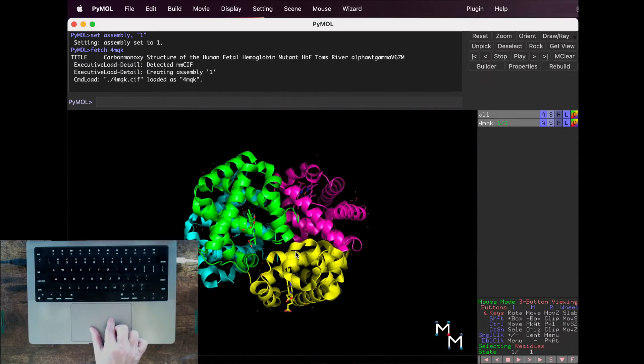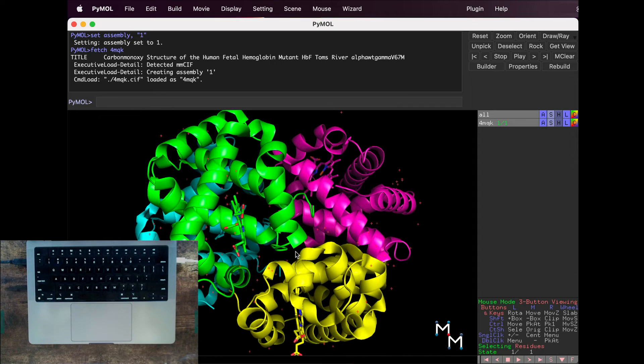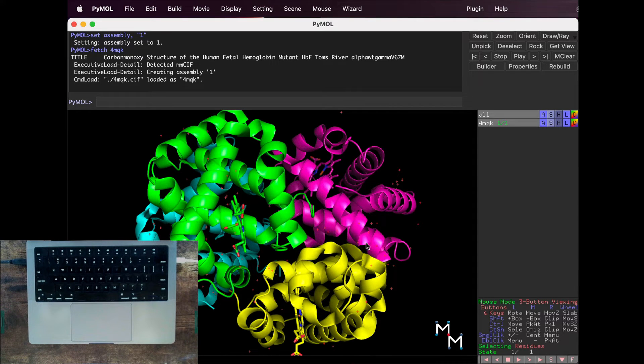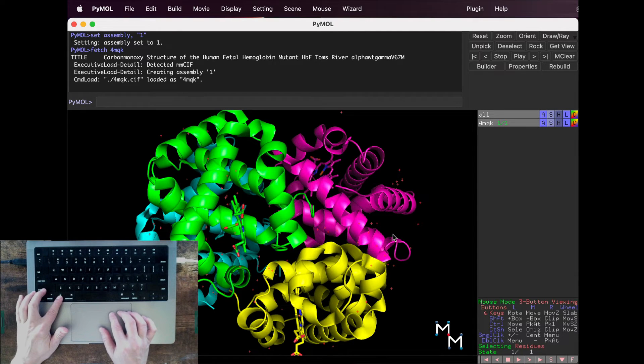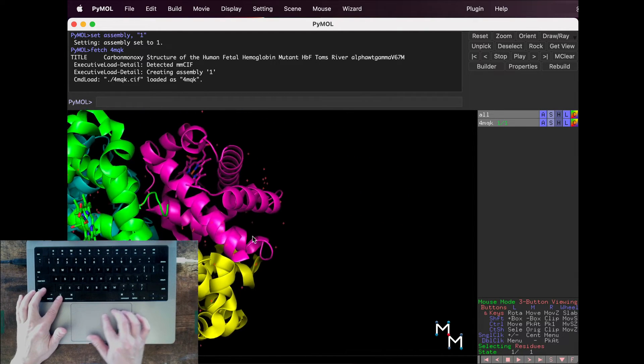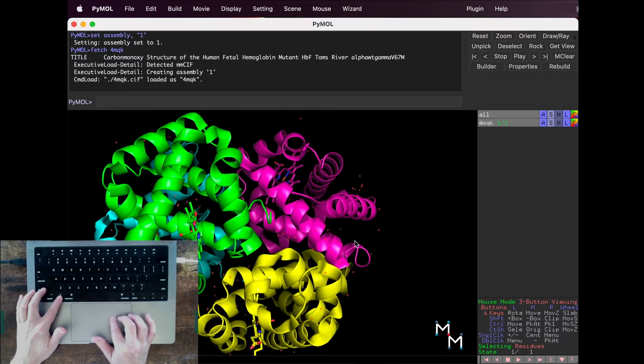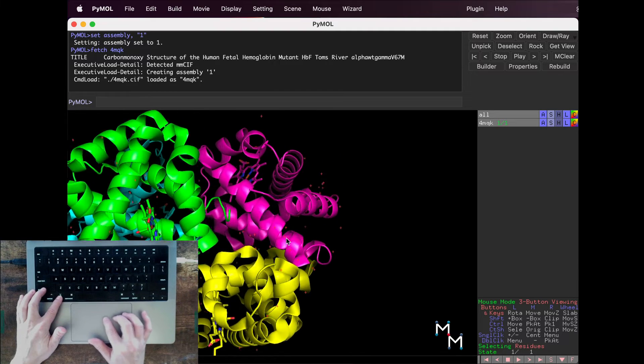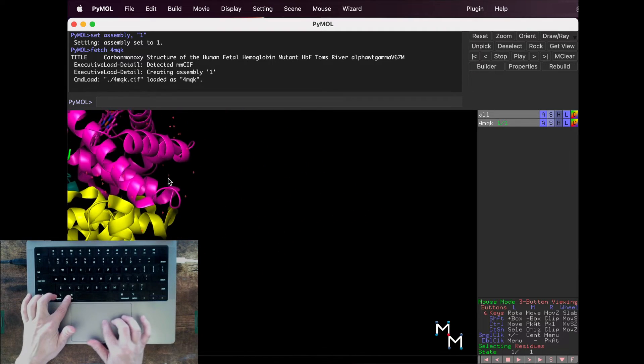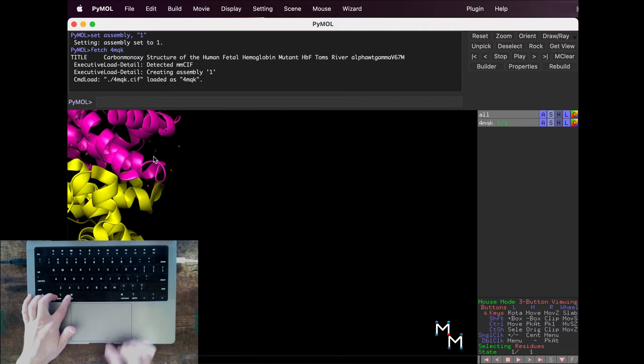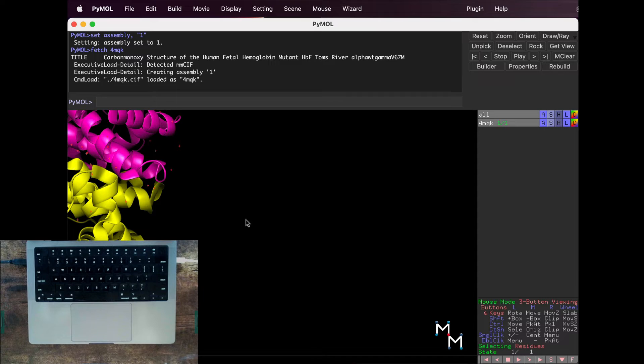Sometimes we'll want to move the whole structure to reposition it. This is a trackpad keyboard combo. On my Mac, I can click either Command or Option, and then click and drag using the trackpad, and this translates the whole molecule.